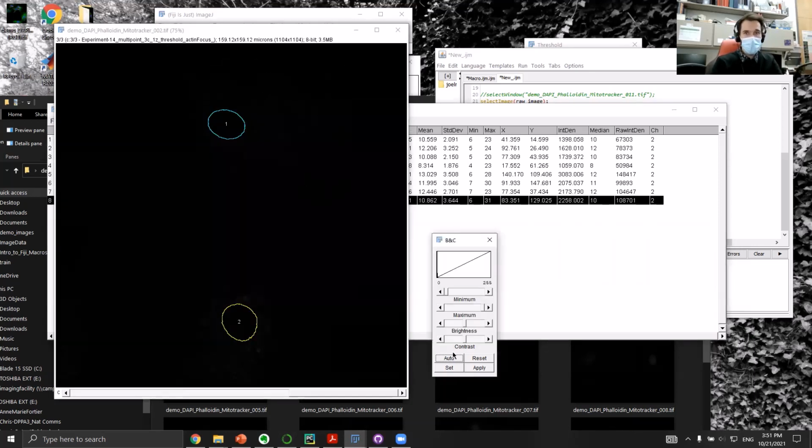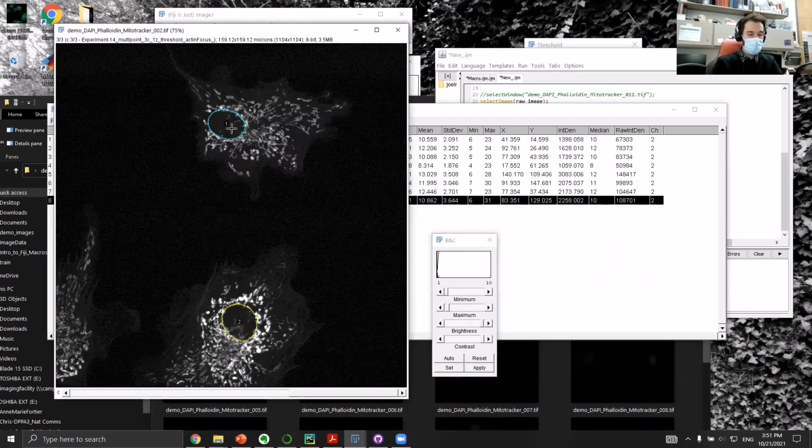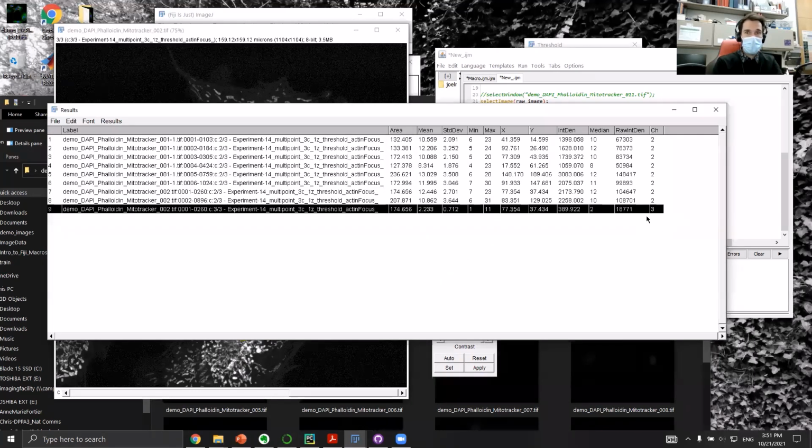Actually, I can do that right now. Suppose we accidentally measured the mitochondria. You'd see this here, channel 3. So then you have to go back and fix it and this and that. So just having something a little bit more streamlined is very helpful.